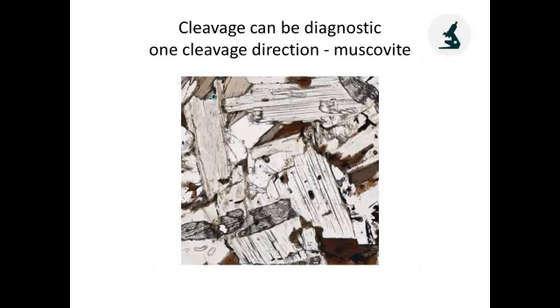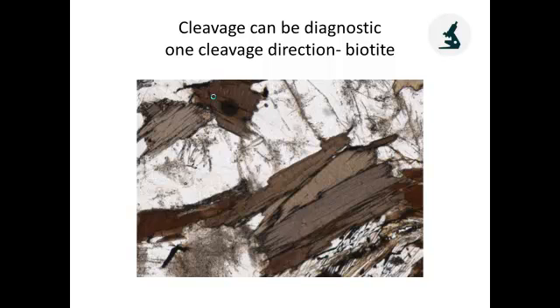So, cleavage can be diagnostic. It's not the only feature, but it can be diagnostic. This is muscovite, a clear mineral, but it's a mica. It has that single, simple cleavage. Biotite that we've just looked at, again, single, simple cleavage. It's diagnostic of biotite. It's diagnostic of micas.